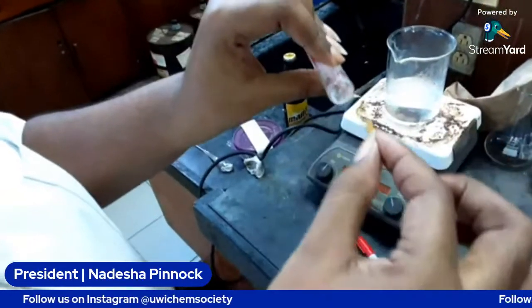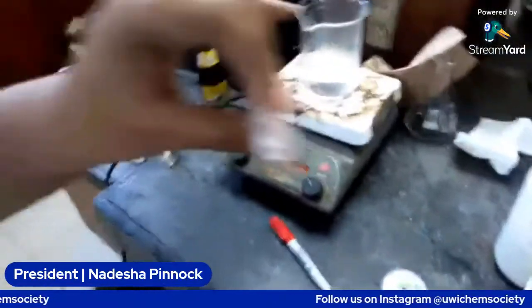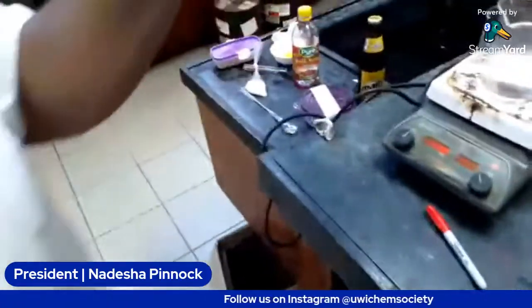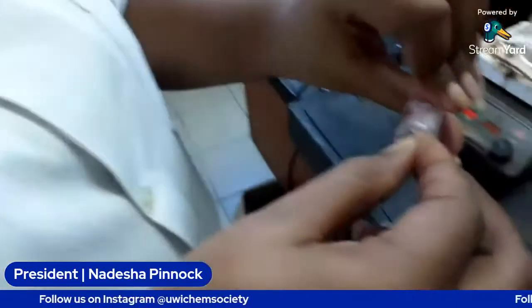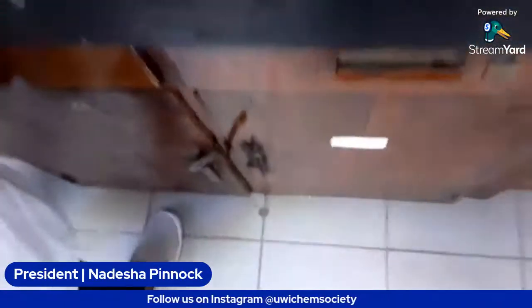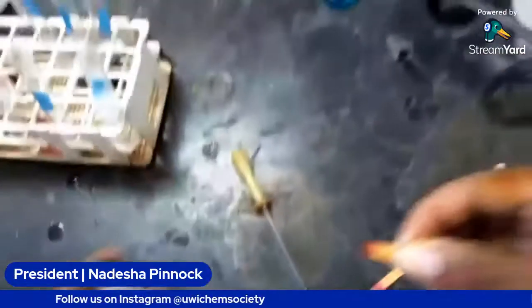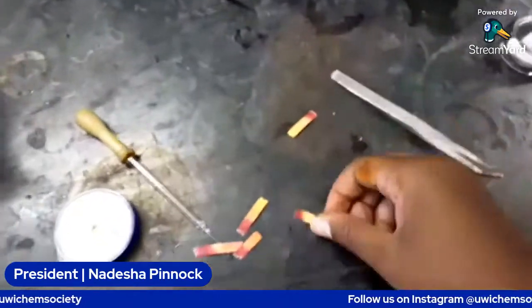Is this thing still acidic? You see? It's acidic when it touches the side. Oh, it's still reacting. It looks like it's alkaline. False alarm. But look how much it is. It's definitely very acidic. Oh my God.